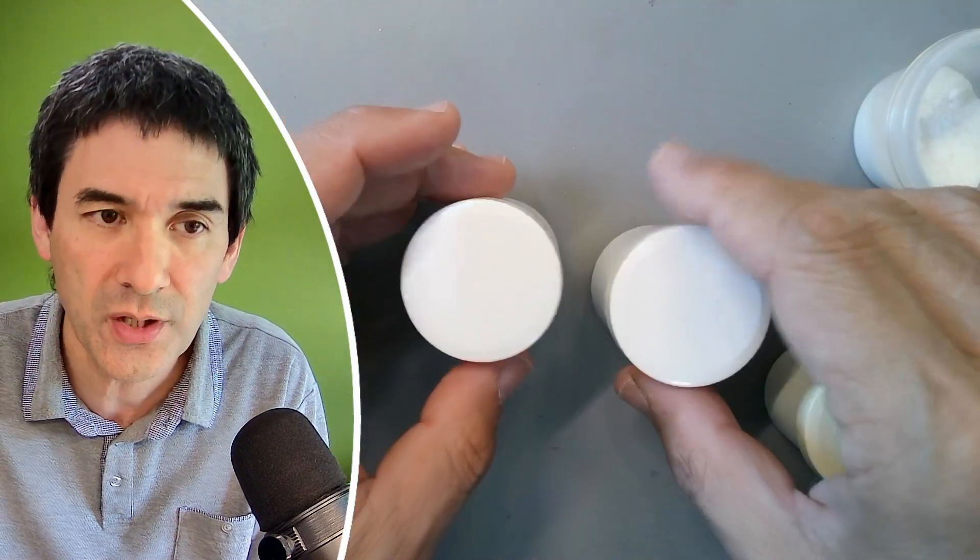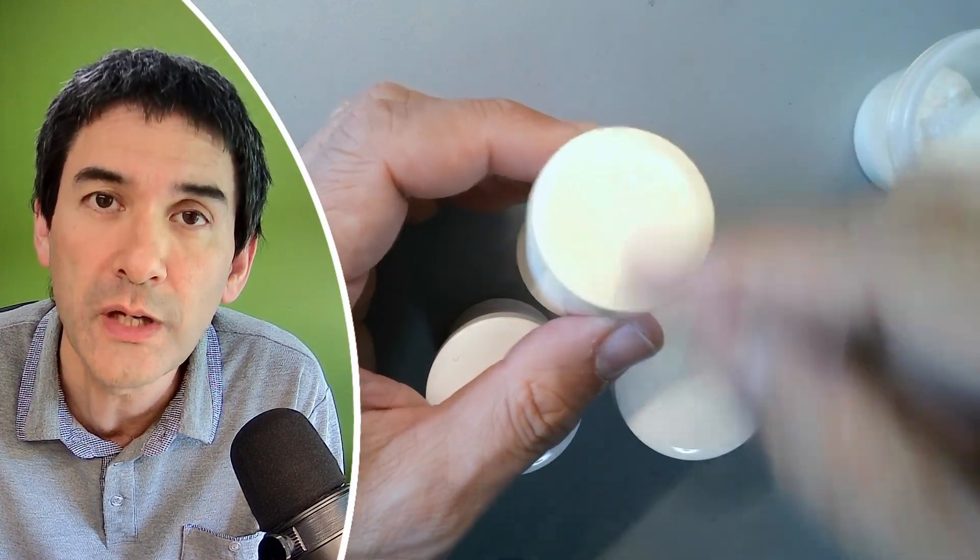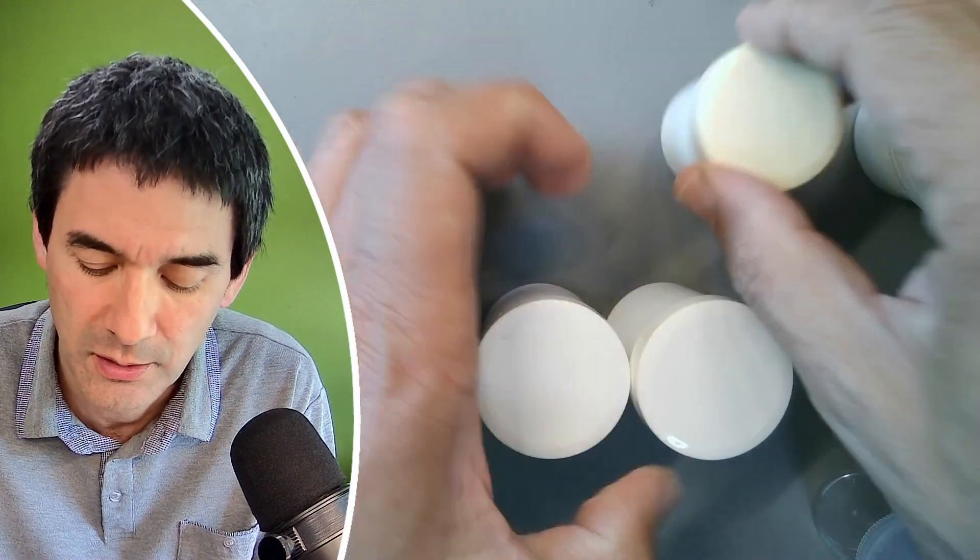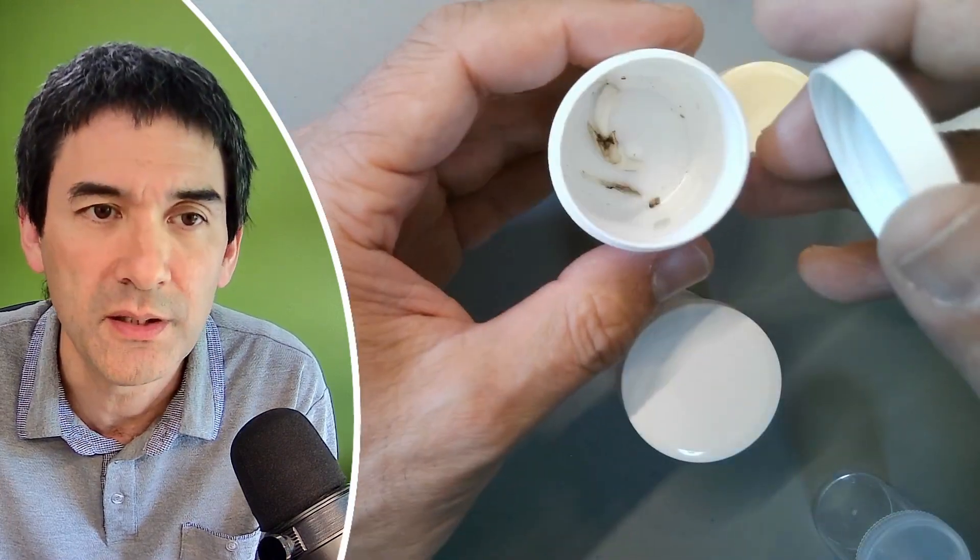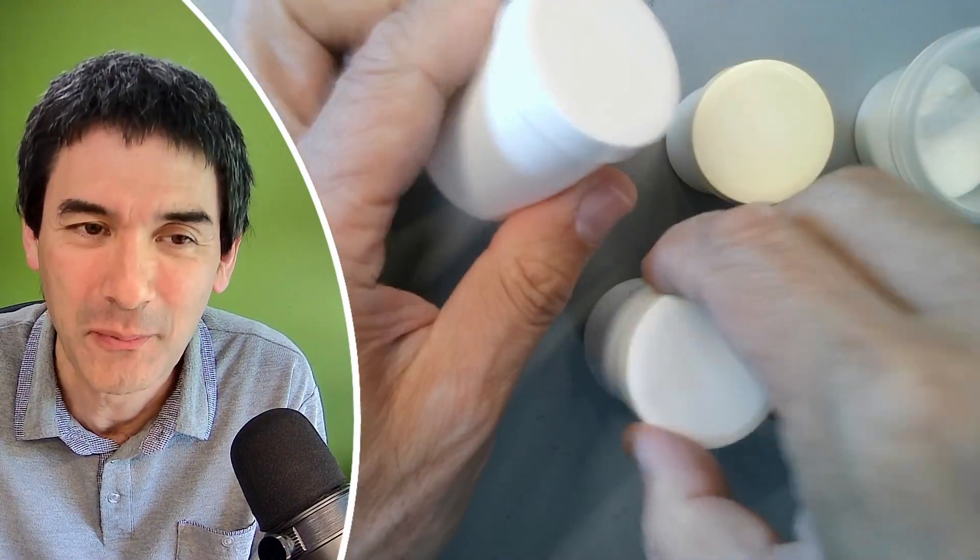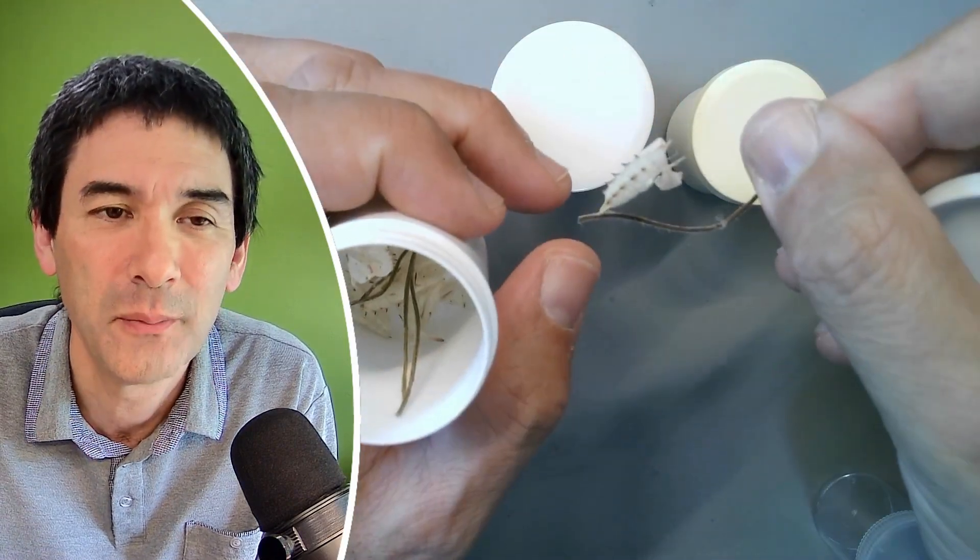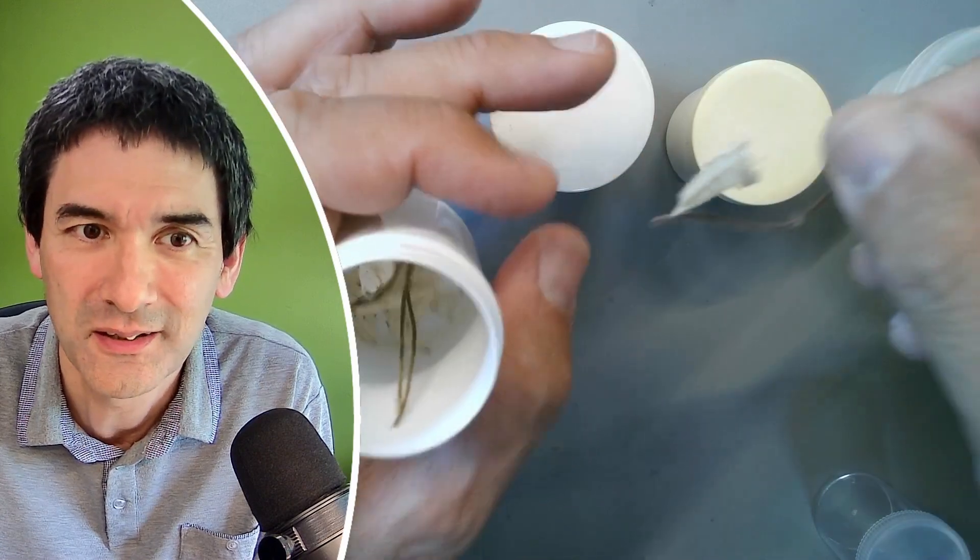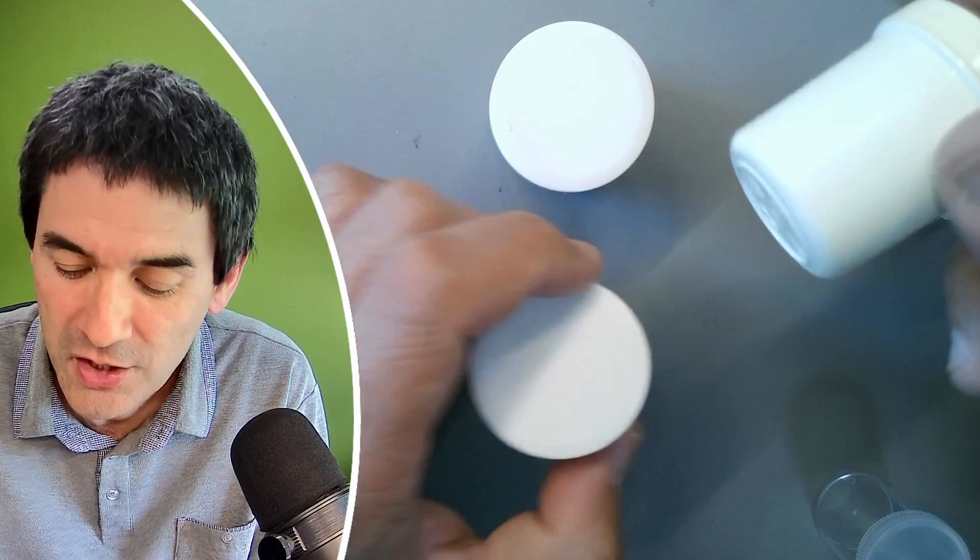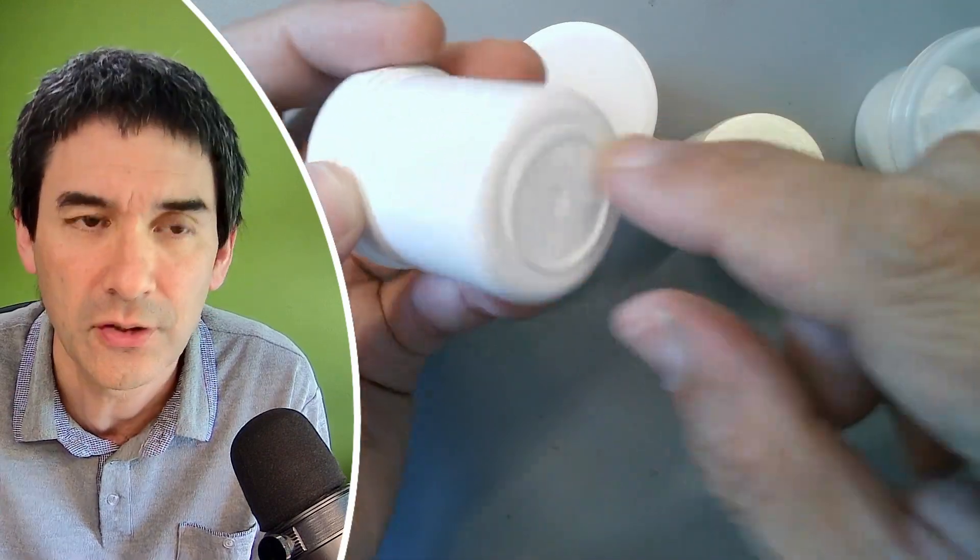A few more containers that I've used over last couple of years are those white containers here I got them from a drugstore and they actually use those containers to put in cream face cream and so on. They also are watertight you can actually see I also collected some dust samples and I don't know what this is. In here as well, by the way these are teeth of an animal I don't know cat or dog, some samples for stereomicroscopy. Here as well these are from a caterpillar when they turn into butterflies it's basically the thing that's left over after the butterfly comes out. These also come in different sizes, 20 milliliters this one over here is 30 milliliters so I got them from a drugstore.